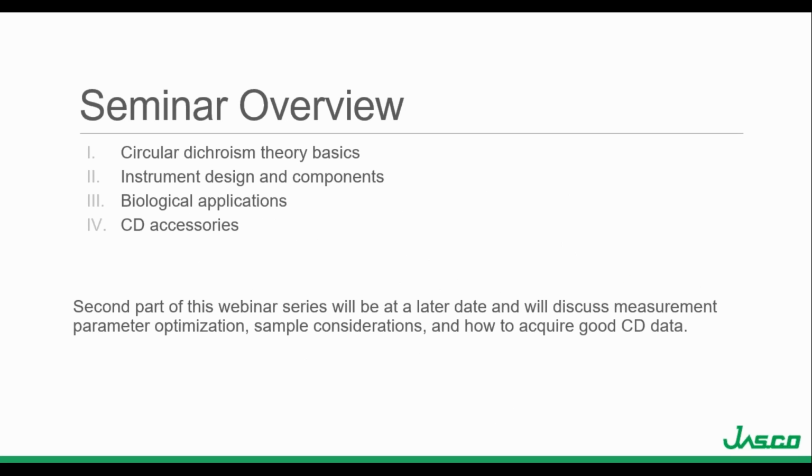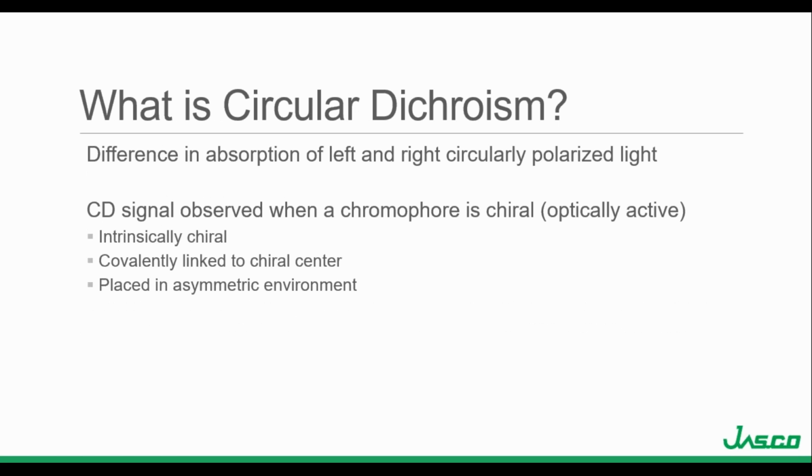Today's seminar is going to include circular dichroism theory basics, instrument design and components, biological applications, and the relevant CD accessories. The second part of this webinar series will be at a later date, and we'll discuss measurement parameter optimization, sample considerations, and how to acquire good CD data.